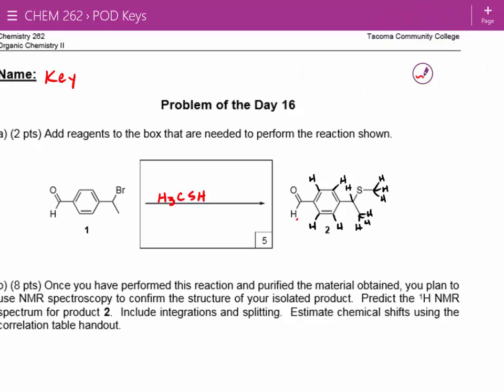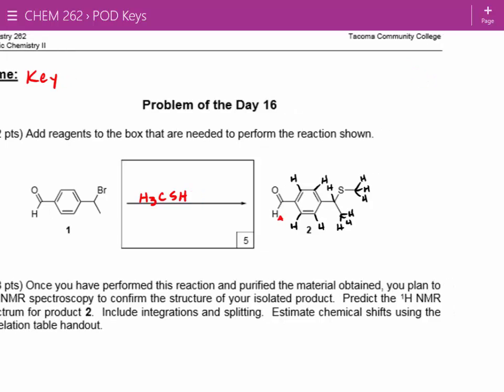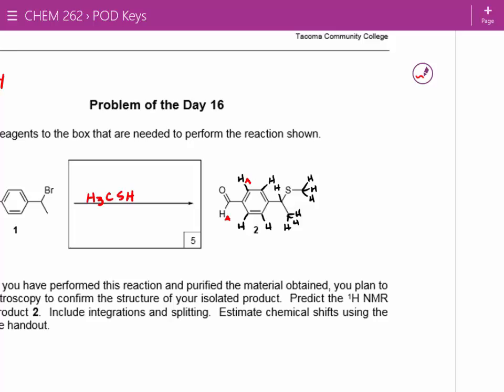All right, so we've got this aldehyde. Are there any other protons like that aldehyde? No, right? There's only one aldehyde group, so that proton is unique. What about this proton on the benzene ring? That should be HB. Are there any protons like HB? I heard some people mumbling yes. The one on the bottom, right? If we think about that aldehyde group, it can spin around like a rotor because it's attached via a sigma bond. So that proton right below HB on the other side of the ring is actually equivalent. So both of these are their own unique set, and we'll call those both HBs.